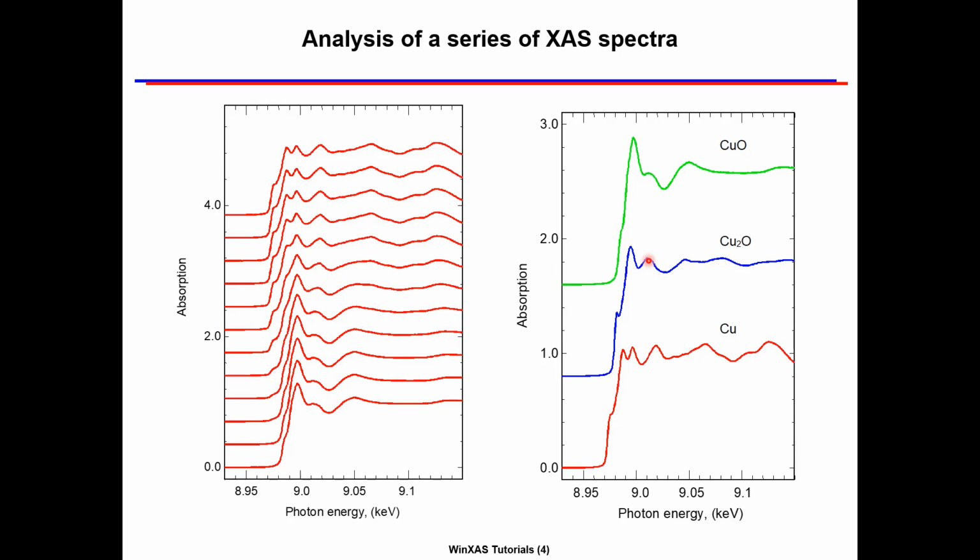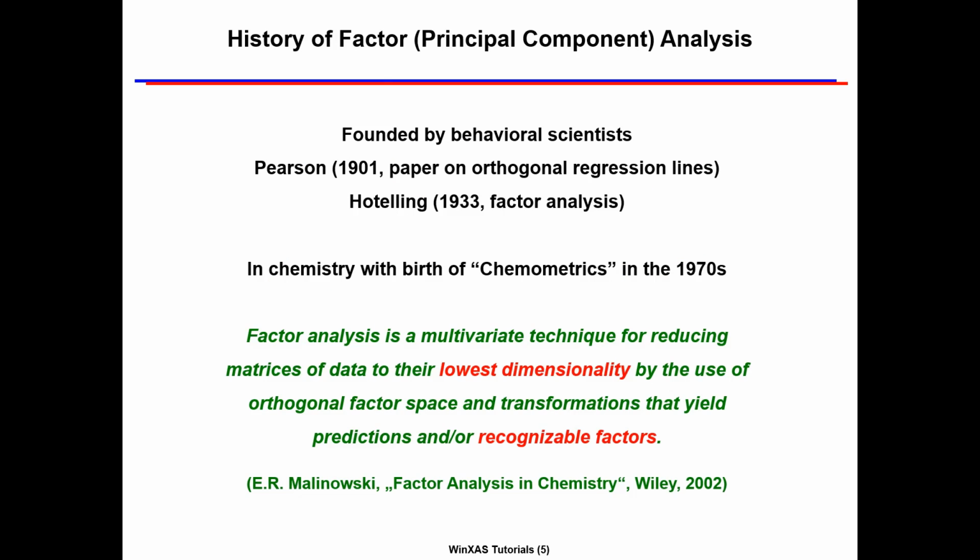And in the following, I want to briefly talk about the fundamentals of factor analysis, in particular about how it is implemented in the WinXAS software. Factor analysis has been around for a while, for instance in chemistry as a part of chemometrics.